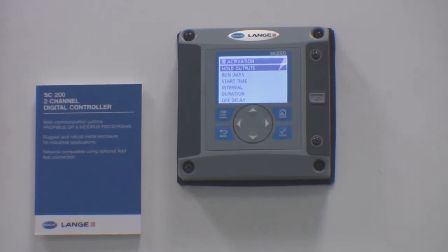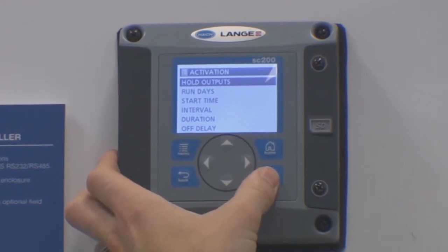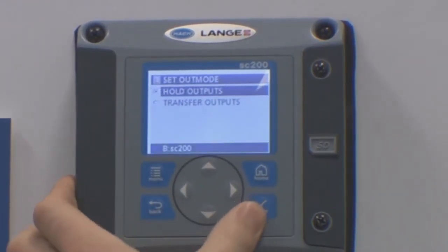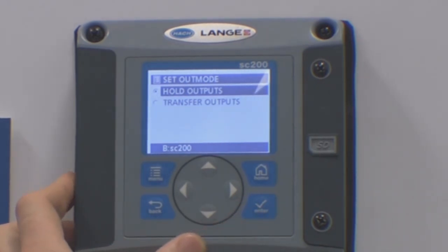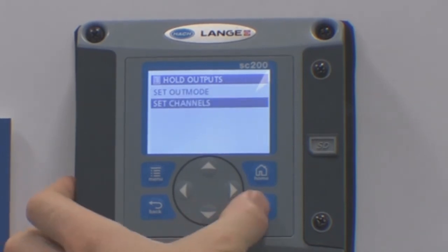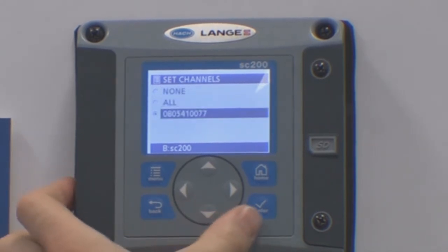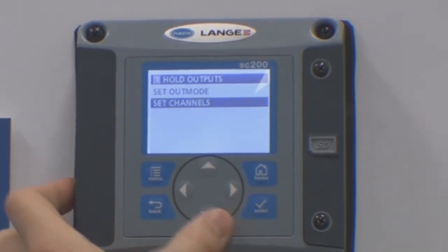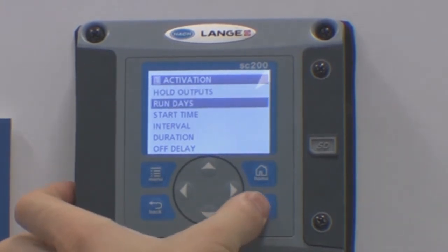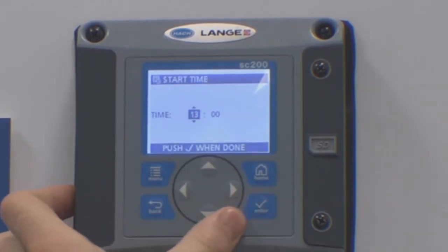Under activation, firstly select how you wish the outputs to behave whilst the air cleaning is active. You can set the output mode as either held outputs or set them to a fixed output value. For the channels, you can either hold all outputs or any associated to a particular probe. You can ask the system to run for set days of the week or to start at a set time.